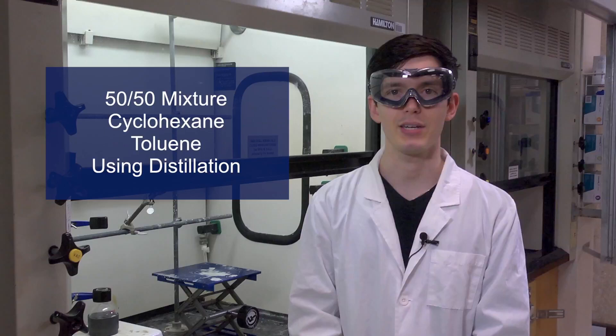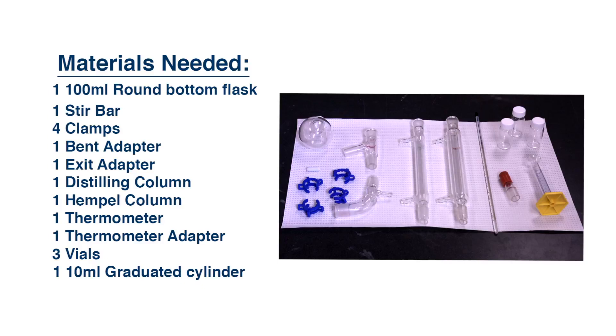We'll begin by gathering the materials. You will need a 100 milliliter round bottom flask, a stir bar, four Keck clamps, one bent adapter, one exit adapter, one distilling column, one hempel column, a thermometer, a thermometer adapter, three vials, and one 10 milliliter graduated cylinder.